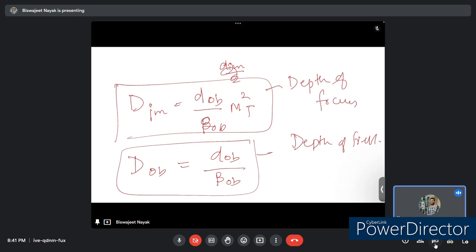So in different circumstances the limiting angle is defined by the illumination aperture alpha. Alpha is called the illumination aperture, or the objective aperture is given by beta in the objective lens. So in thin specimens which scatter weakly, most electrons emerge from the specimen in a cone defined by alpha of image, which is very small, and in thicker, more strongly scattering specimens, this objective aperture defines the angle.